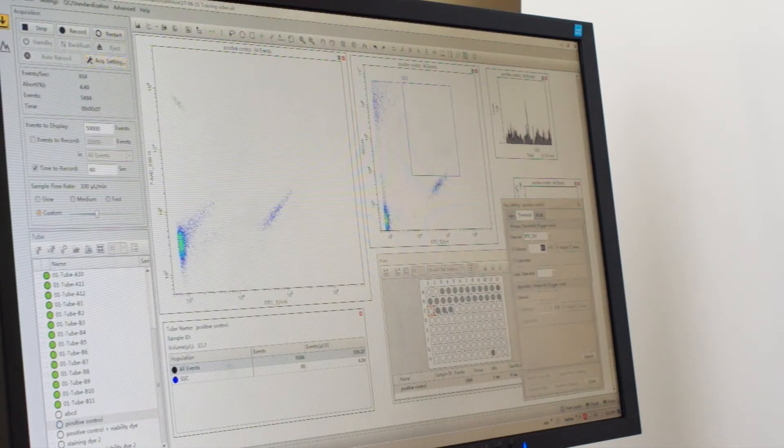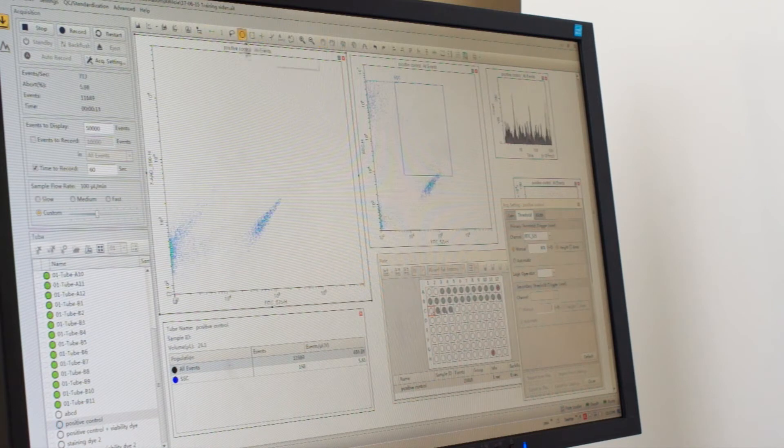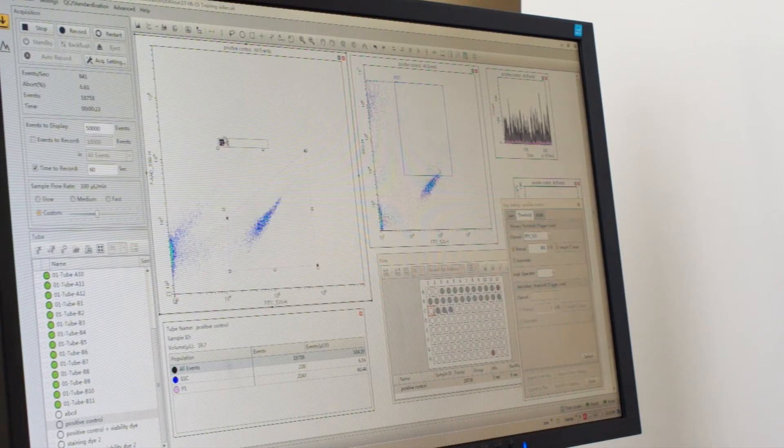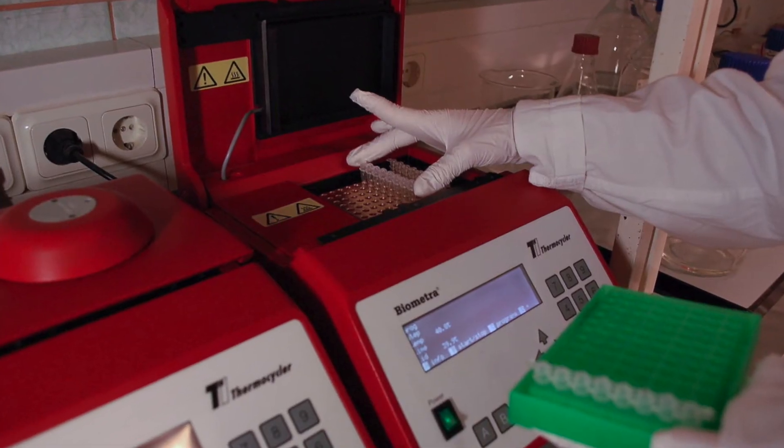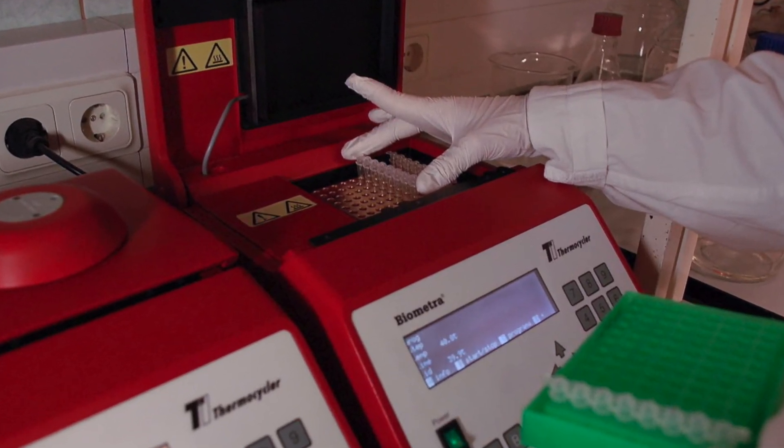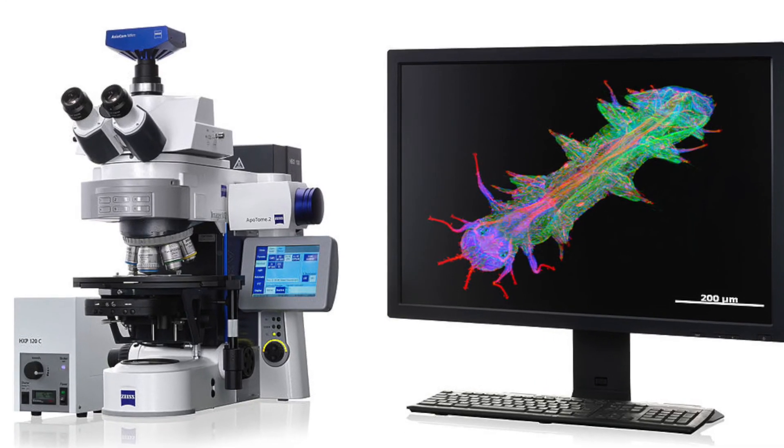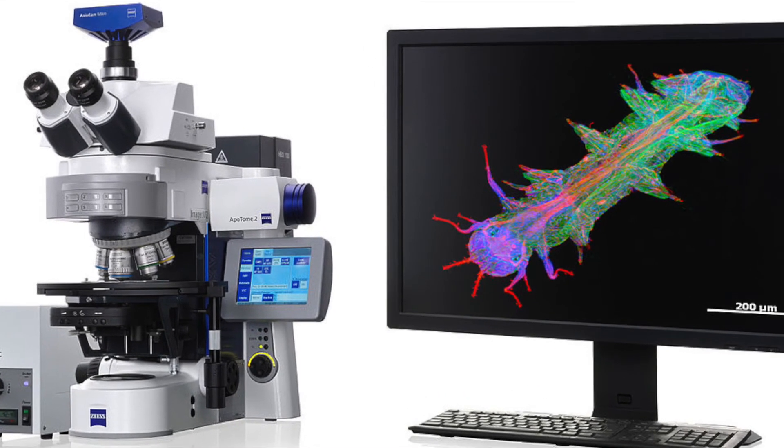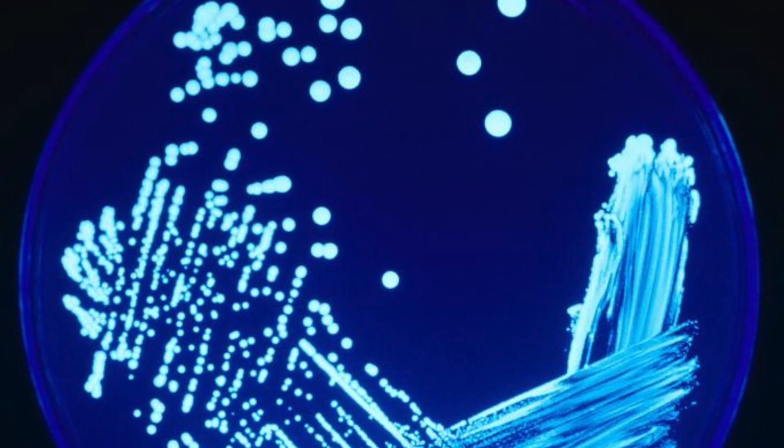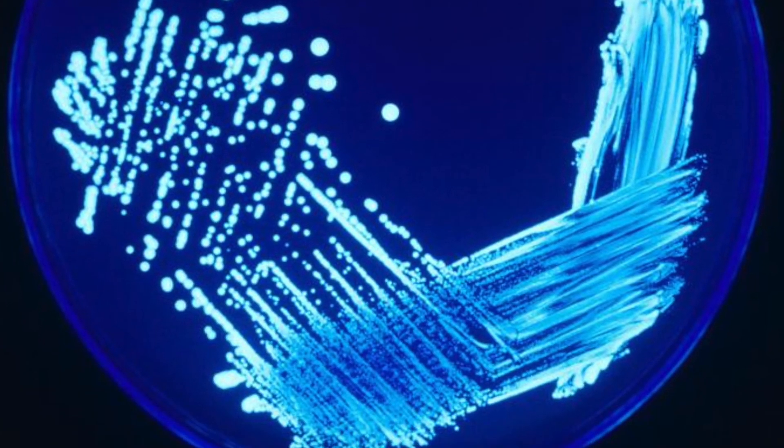In the RQ Macro kit you will also find a tube that contains a positive control, which will help you set the gate correctly. If you do not work with flow cytometry, you can also analyze your sample by PCR, fluorescence microscopy or simply by adding a specified volume of the sample onto a Petri dish.